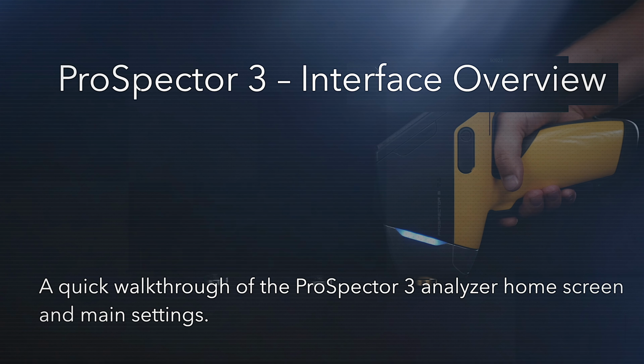Let's see how it looks. Battery monitor, and here you see that AC adapter is not present. Battery present, yes, and battery charge 24%, and so on. So you can control all the components of the analyzer with these monitors.